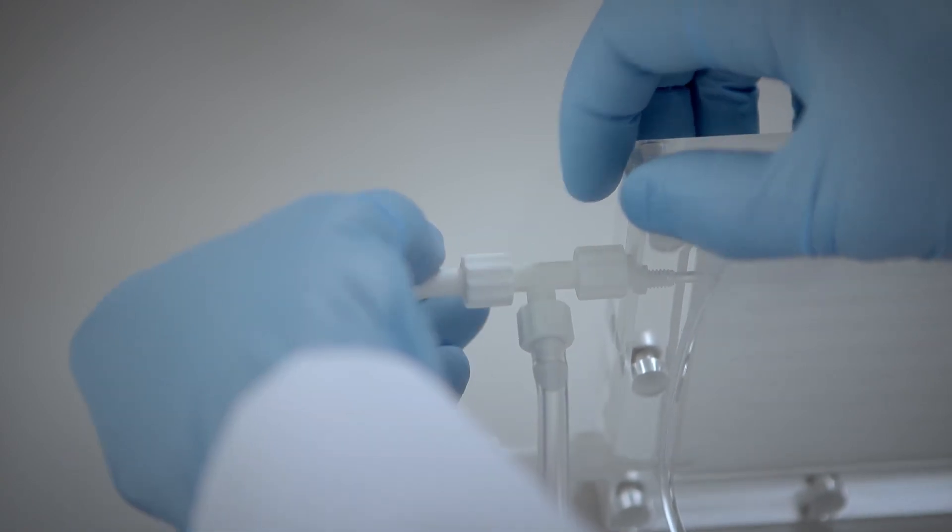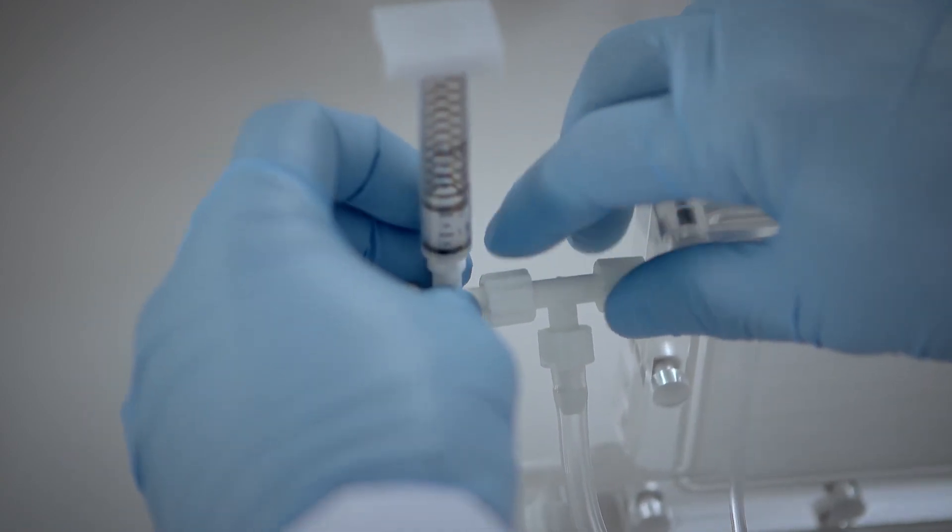Then attach the pressure indicator and the retentate tubing with the pink color-coded flow restrictor.